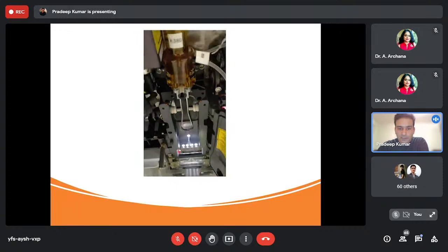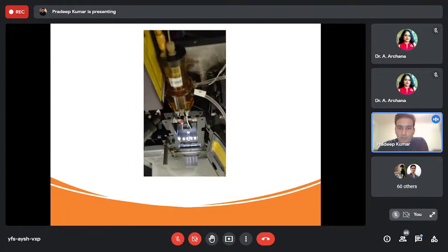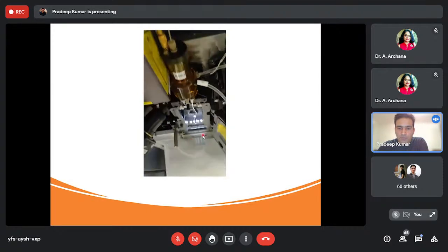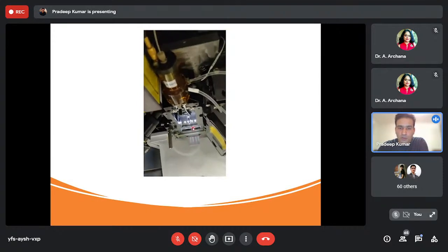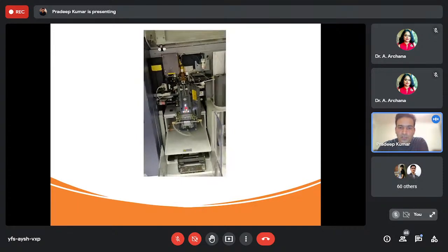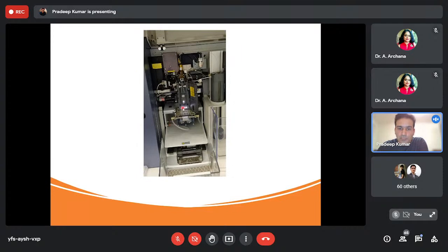So those are the different 4 streams. When we put the voltage on the deflection plate, you can see 4 streams going into 4 individual Eppendorf tubes, and the central one is the waste. The cells which we don't want go just to waste, and the deflected populations go into the individual tubes to be sorted.